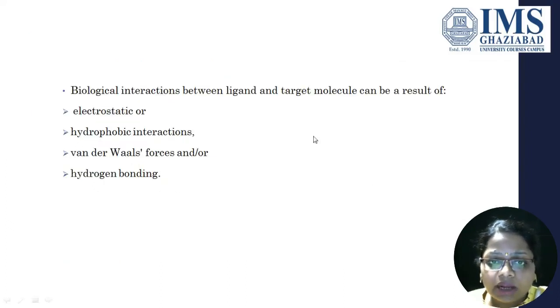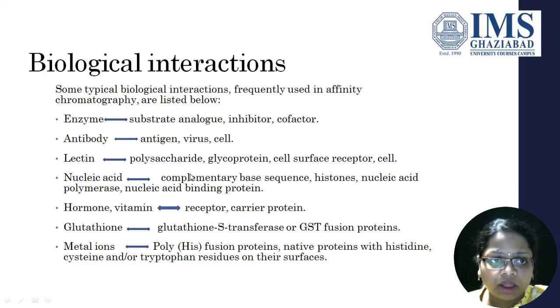So what types of biological interactions play between the ligand and the target molecule? They can be electrostatic, hydrophobic, van der Waals forces, or hydrogen bonding.